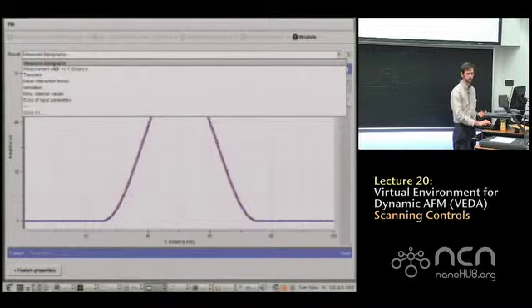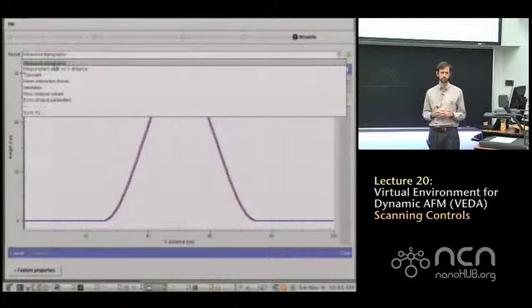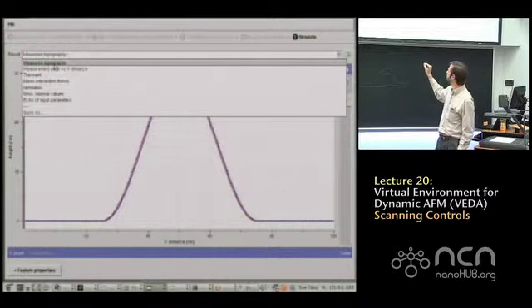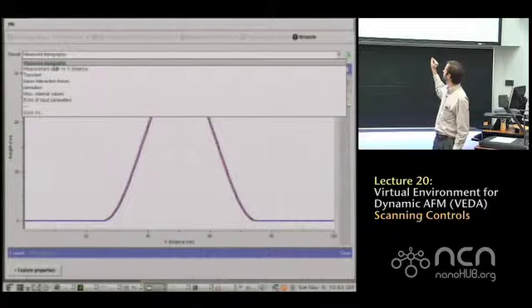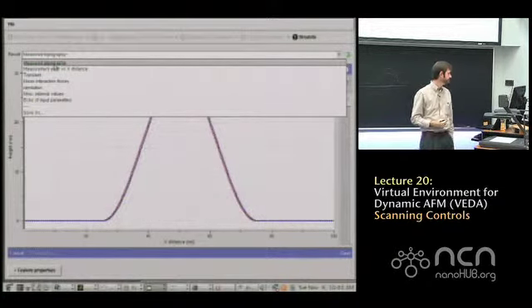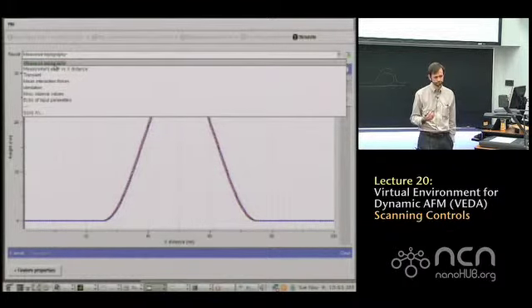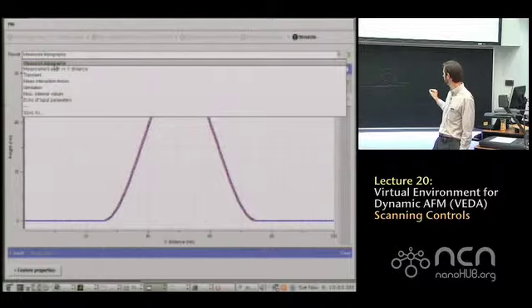So just to clarify, we've used different terms, but as far as the scanning tool is concerned, there is a substrate and there is a feature. Yes. But you remove the sample also. So this is a substrate. Right, but sample is the whole thing. I'm just saying that if you refer to feature and substrate, then we should stick to that. Yeah, okay. So we'll call this a feature. We'll call this a feature. We'll call this a substrate.